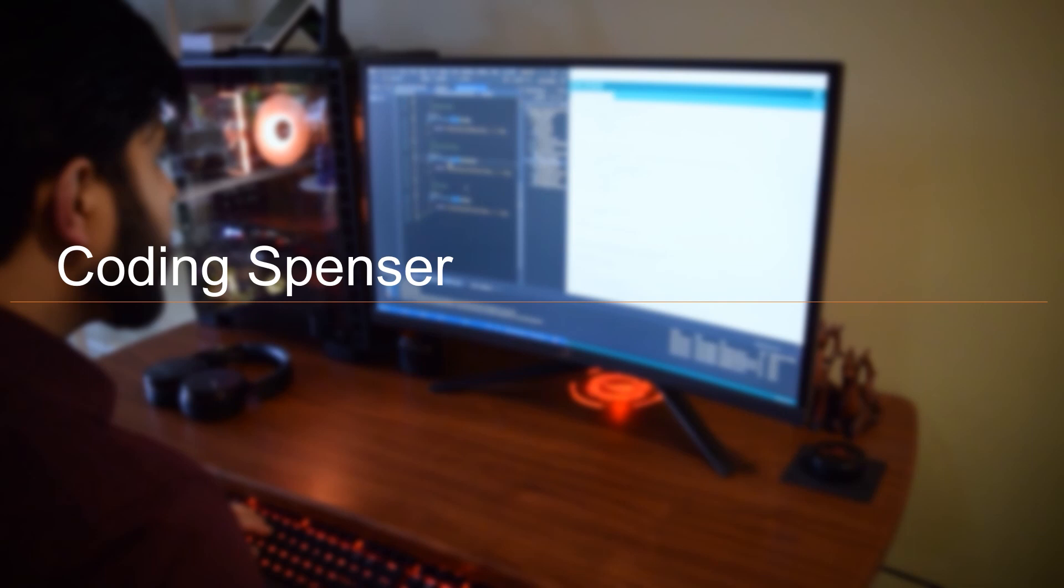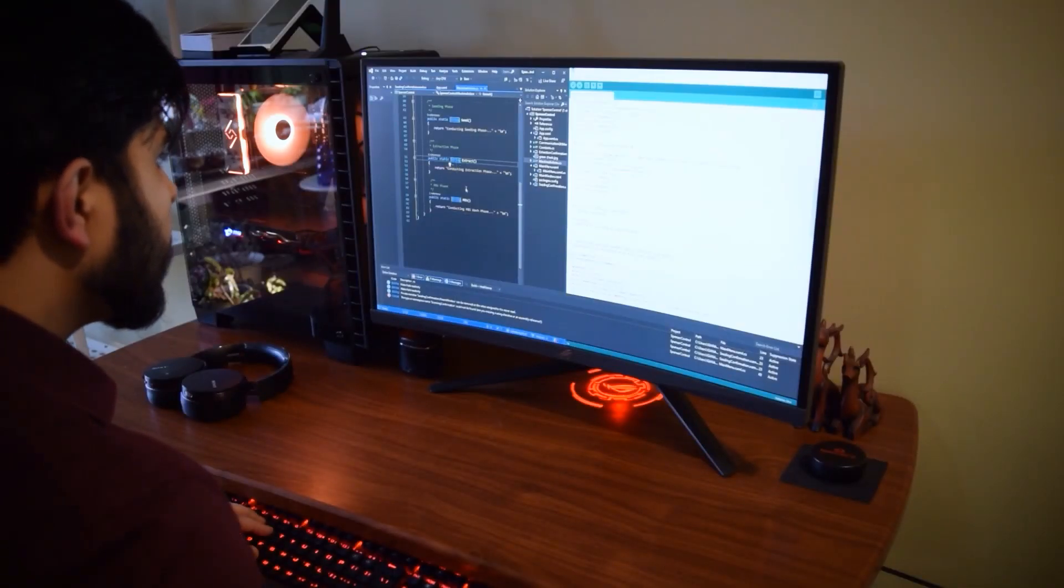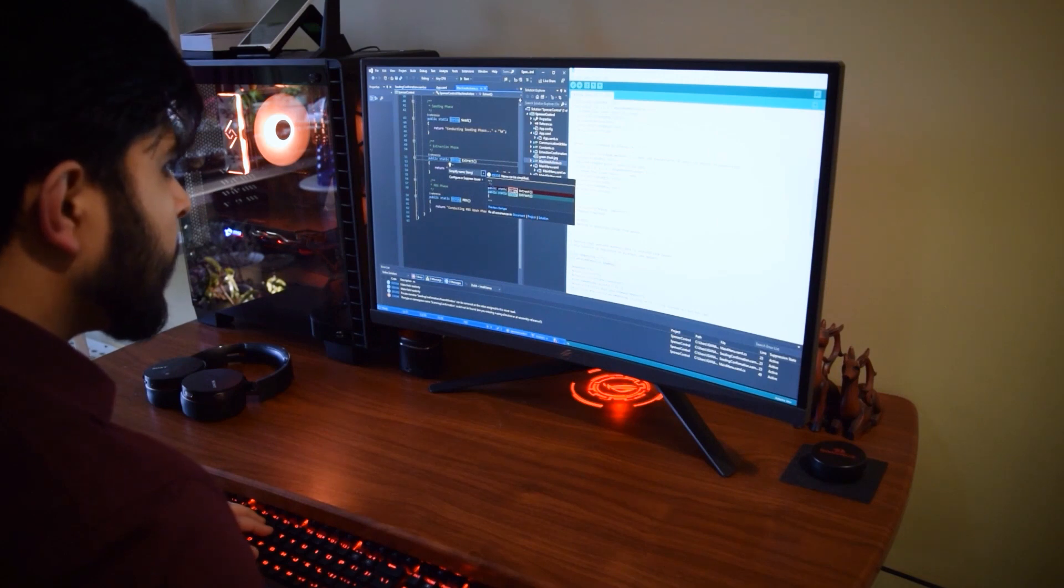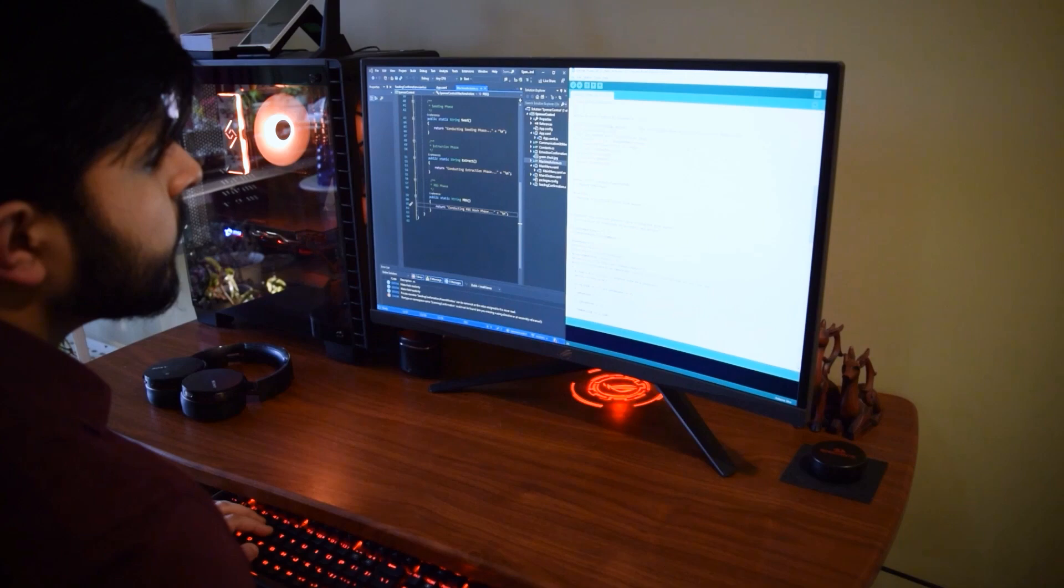Spencer's user interface was created on Visual Studio based on the .NET framework. The main board was flashed with Marlin firmware to mimic similar features to that of the common 3D printer. Actuation and communication between the Nano and the Mega for the syringe pump was coded in the Arduino IDE.